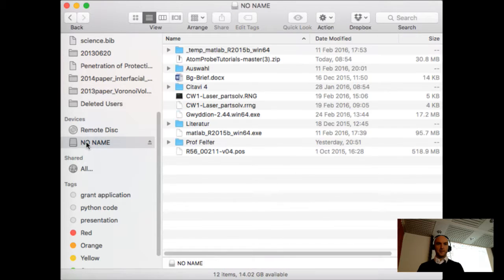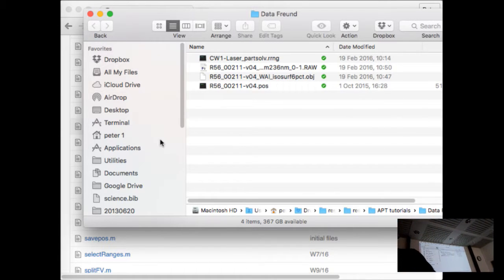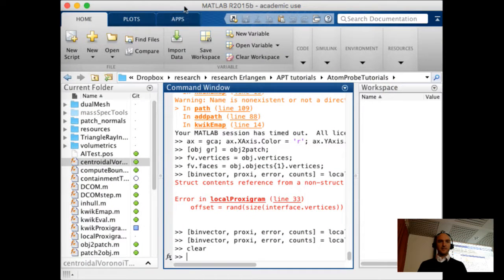Anyway, if you're out there and if you're not part of Erlangen, you will just have to use your own data, simply because. Bloody hell. No cursing on YouTube. Anyway, I'll start doing it. So while you're copying, you can just watch.